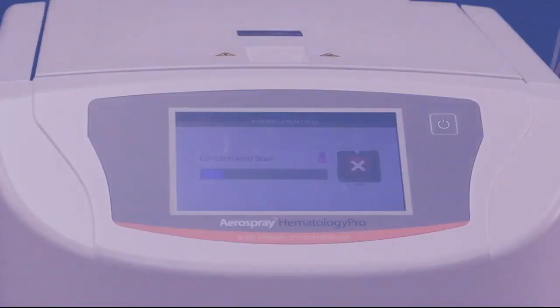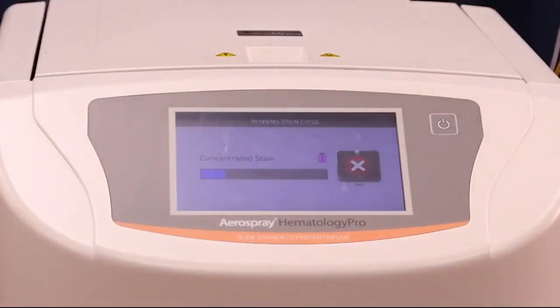We're going to fast forward through these steps, but as you can see, there's a display bar that gives the percentage completion of each step. After the concentrate stain, the instrument will perform a mid-rinse of the slides. This is done with either a 6.8 or 7.2 pH buffer solution. This step can also be adjusted to increase or decrease the amount of rinsing performed.